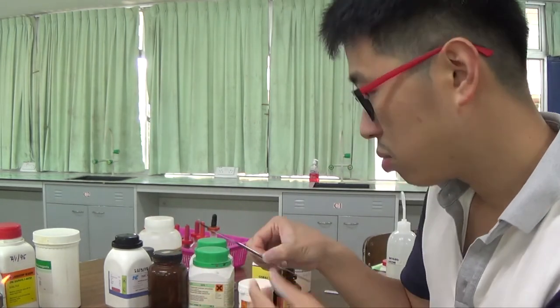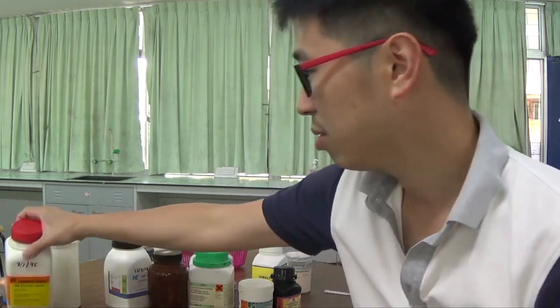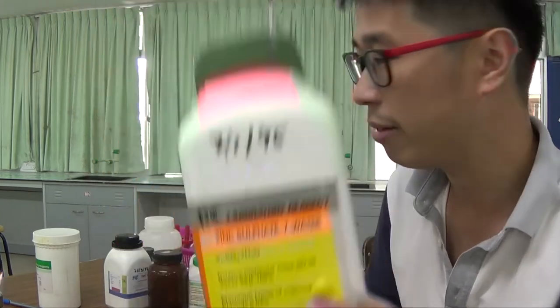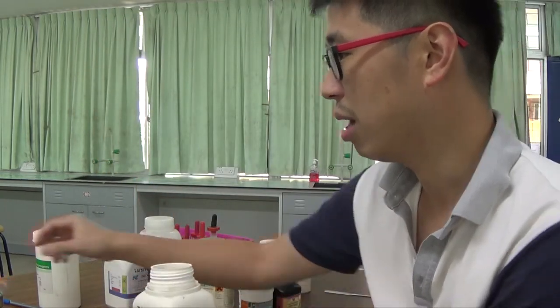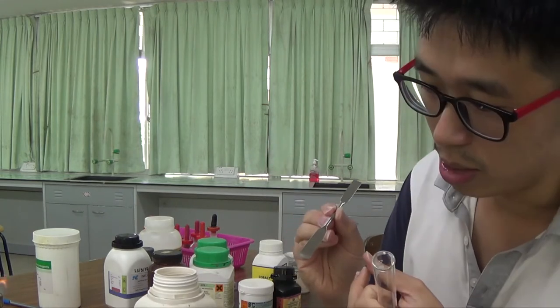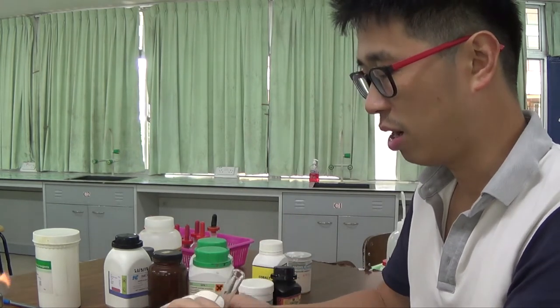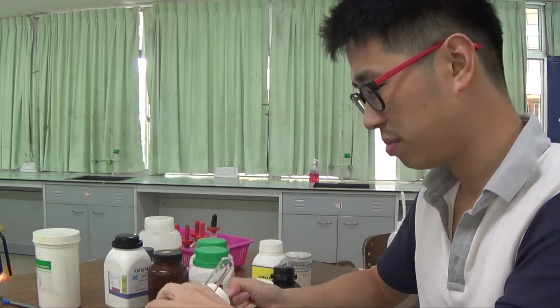So I used this one to scoop out the sodium compound just now. I'll show you another one. Now I use the zinc sulfate. It should produce the same result. Oh no, I used this one just now. So do not contaminate your chemicals, so make sure you clean up your spatula after you use it.